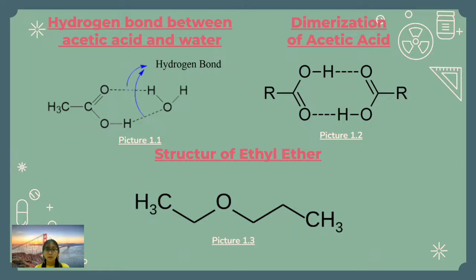This is due to an equilibrium between the top layer, acetic acid and ethyl ether, and the bottom layer, acetic acid and water, where the acetic acid at its initial concentration is divided into both layers, so the acetic acid in the lower layer that has been calculated has a smaller concentration compared to the concentration before extraction. Microscopically, the equilibrium occurs dynamically, where acetic acid moves through the interface between the ethyl ether and water until it is completely dispersed in both layers with a constant concentration.